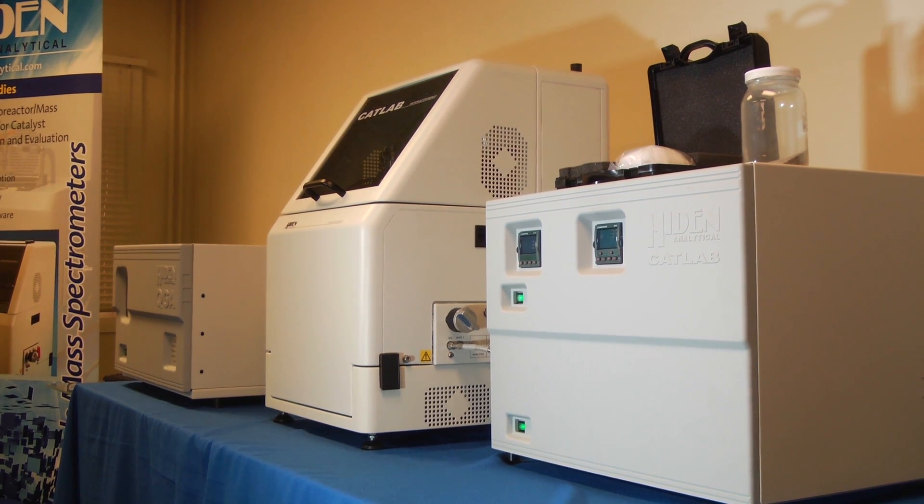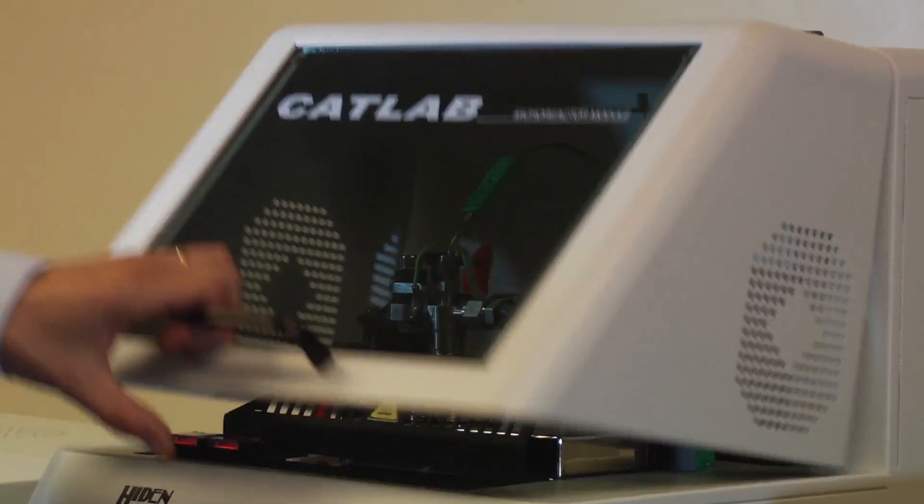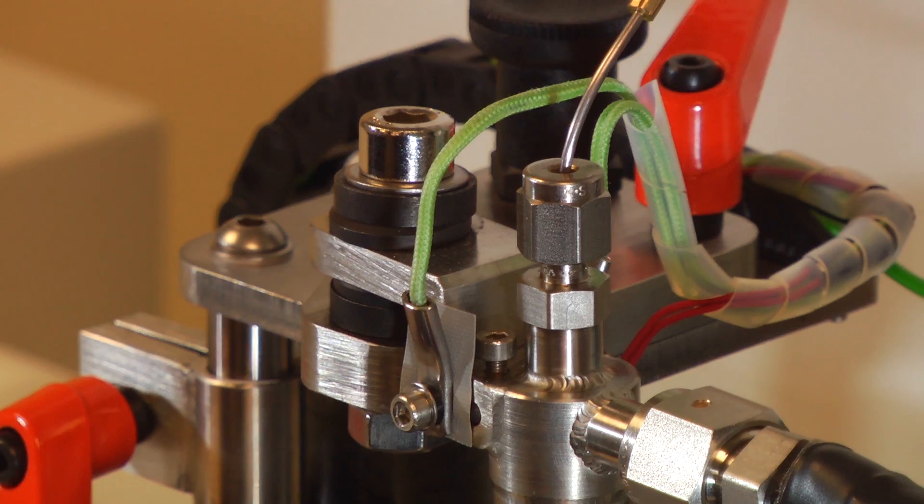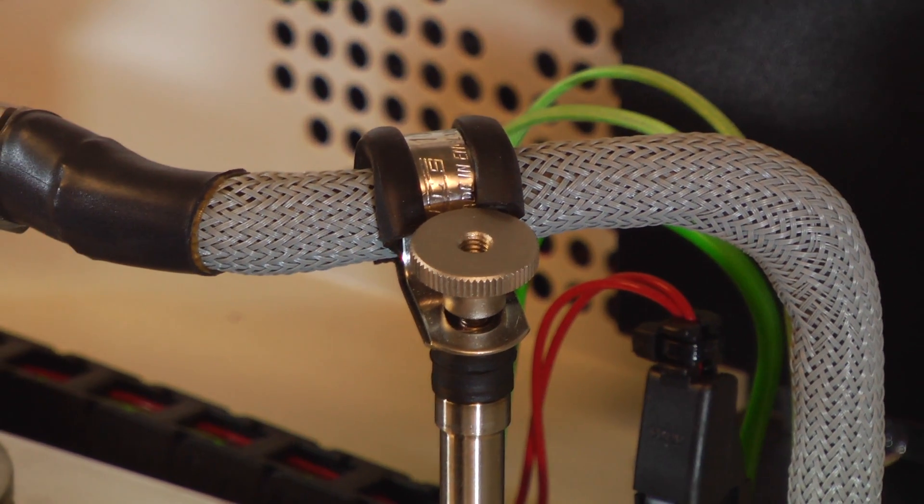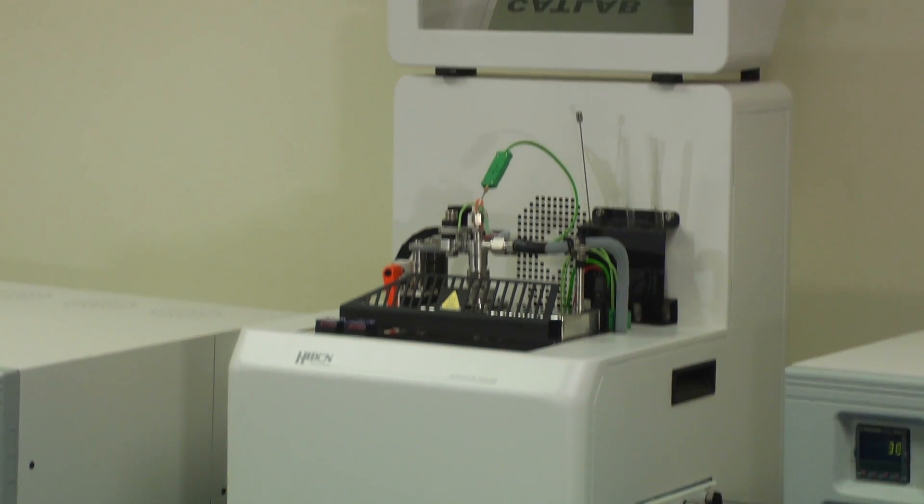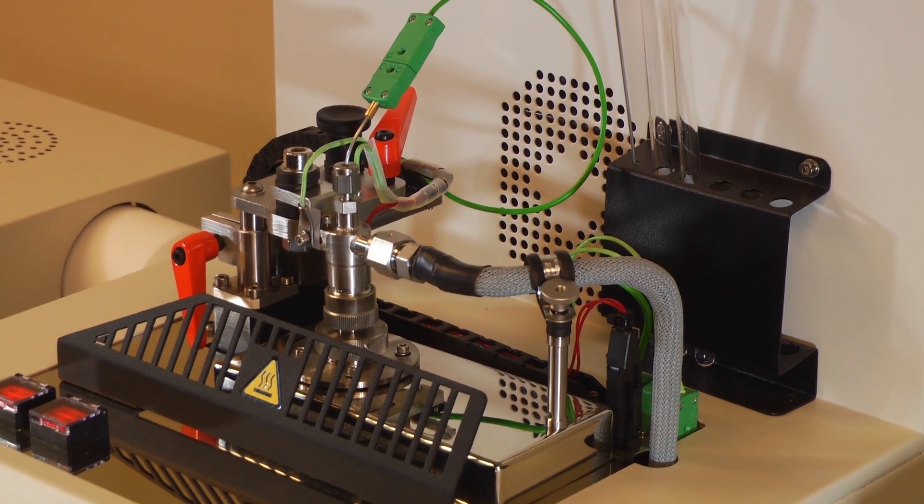The modular benchtop system features an atmospheric pressure quartz reactor in a fast response low thermal mass furnace with integrated air cooling. The sample sits in a novel catalyst cartridge system providing simple reproducible sample placement with minimal change over time, and the in-bed thermocouple ensures the optimal measurement of the catalyst temperature.